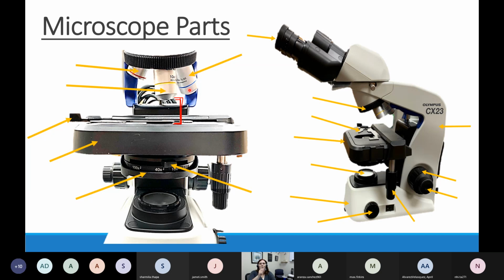Now I'm ready to go up to yellow. And once I'm on yellow, I can only use the fine adjustment knob, get it in focus, go over to blue. Fine adjustment knob, get it down. So the fine adjustment knob is fair game with any of the objectives in place, but the coarse adjustment knob can only be used when we have the scanning objective in place.